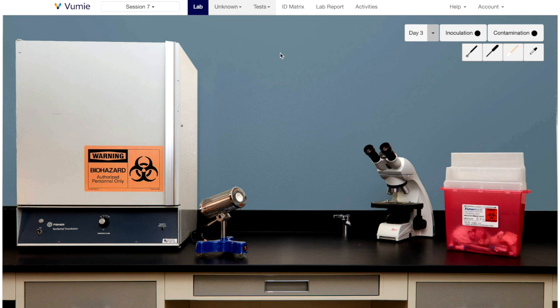Here's what it looks like in the virtual lab. We have taken a few liberties to allow this technique to be simulated.